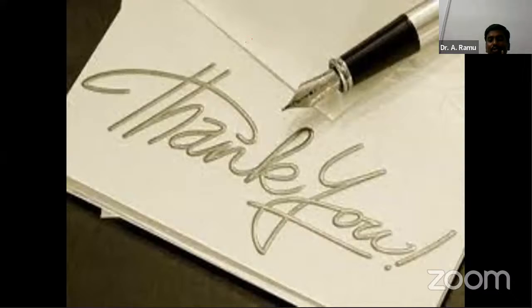So now the discussion on the evaluation test for suspensions and emulsions is completed. Please once again explain the uniformity of content test of suspension.